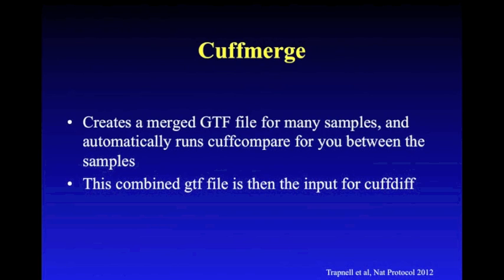Another program is cuffmerge, which creates a merged GTF file for many samples. It also automatically runs cuffcompare. The combined GTF file can then be used as the input for cuffdiff.